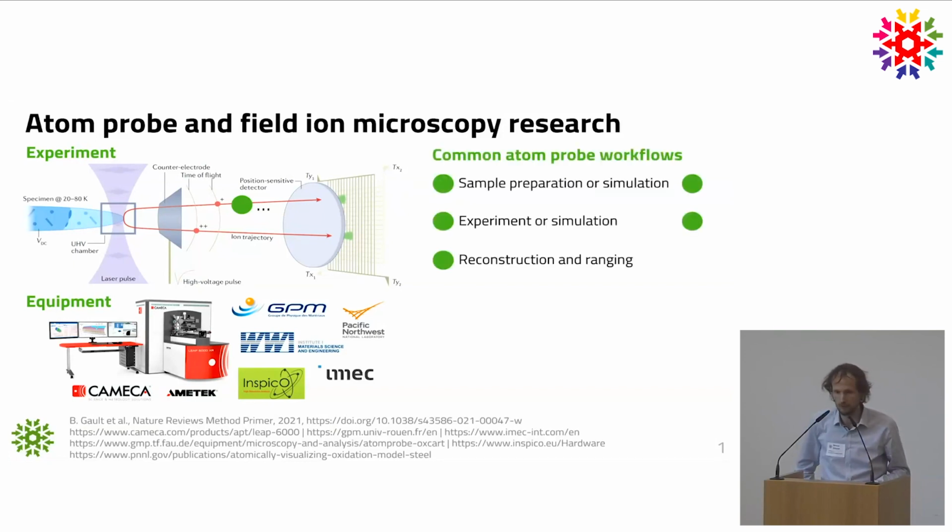When we talk about atom probe tomography and how it's done, it is strictly incorrect to view this as just time spent on a microscope, which is what experimentalists spend most of their time on. Much happens before and after, to arrive from the raw detector readings at the one or two figures typical of materials science and condensed matter physics papers, where you show the point cloud of atoms and the structural features, clustering atoms into functional groups, interfaces and phase boundaries, from which you generate your knowledge.